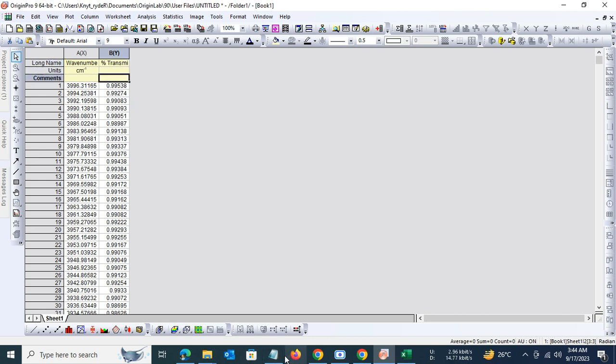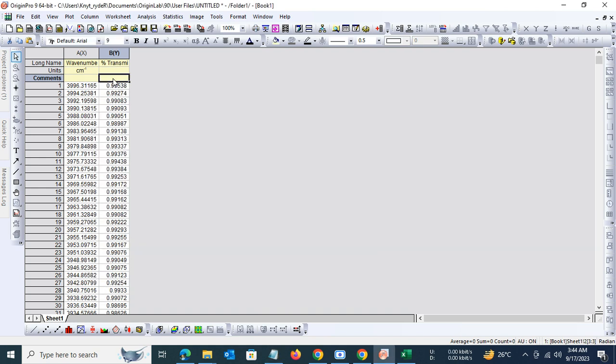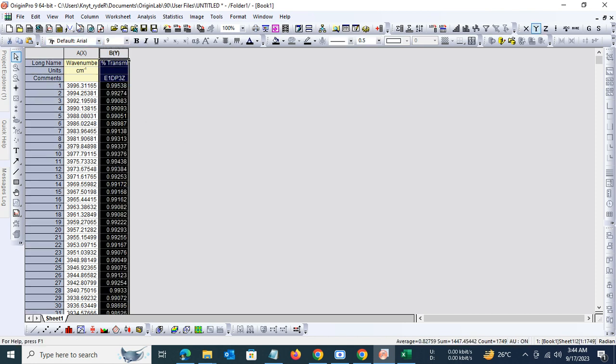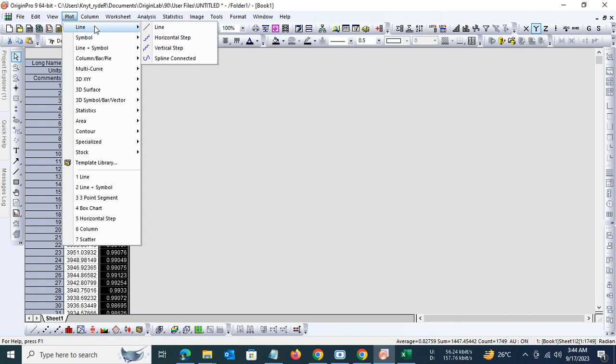The name of the sample for which we are developing the IR spectrum is E1DP3Z. Okay, so we are all set now.